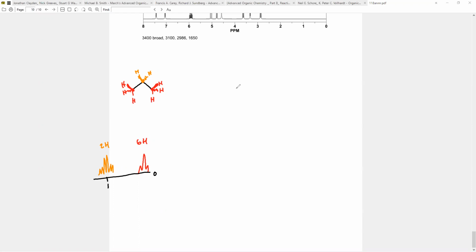So that works out. So currently hydrogens are working out, right? We can move up to butane and do the same analysis. We could say, okay, let's look at this carbon here. It's 3 hydrogens, which is symmetric to this guy here. And then we have these guys in the middle, these 2 H's, and those 2 H's there.